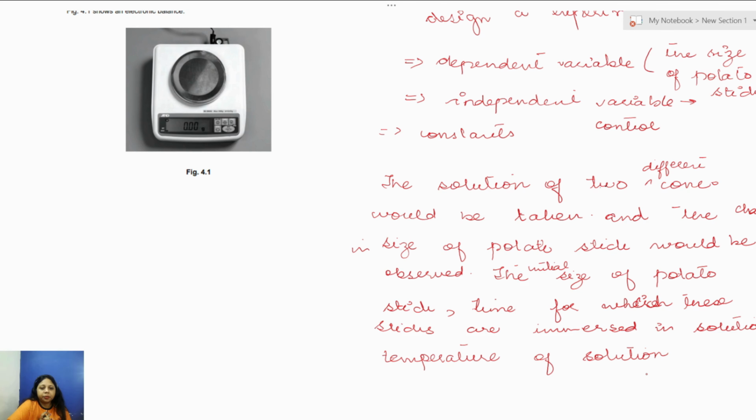If we boil them, the enzymes denature and the structure of the cell wall and cell membrane gets disturbed, so there won't be any control of movement at all. You are basically denaturing the cell membrane as well as the cell wall. The cell membrane is the one which controls the movement. Denatured.